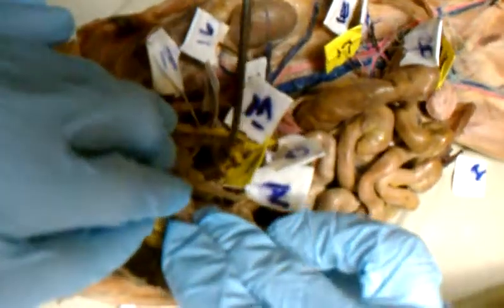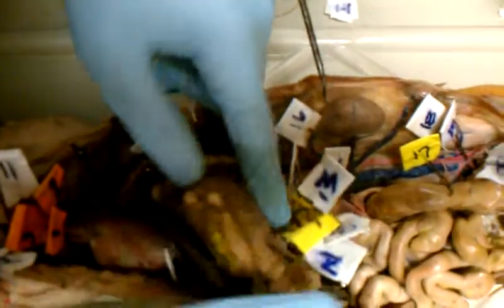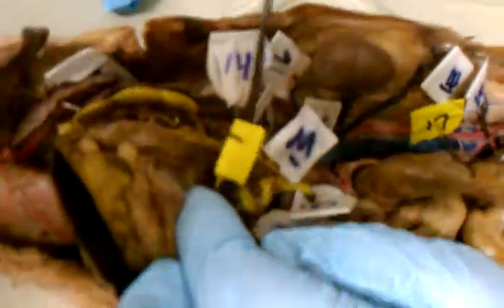This is the gastrosplenic. Oh, that's the hepatic portal, the great big fat one right there. Oh, there it goes. That's your gastrosplenic. Okay, I see it. Coming into the hepatic portal vein superiorly.